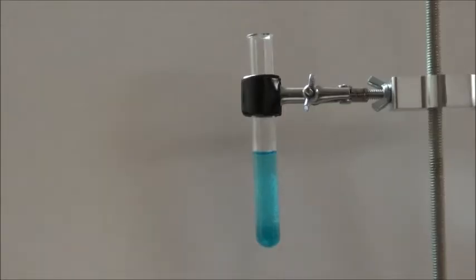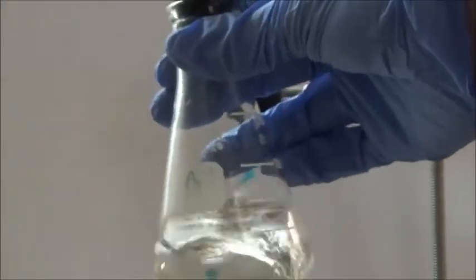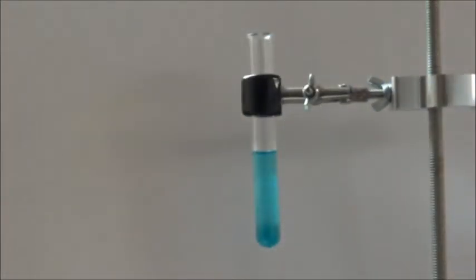First, I prepared a copper sulfate solution by dissolving a small quantity of copper sulfate, probably about 0.5 grams, into about 5 milliliters of water. I have here an approximately 0.1 molar solution of sodium sulfide in water.